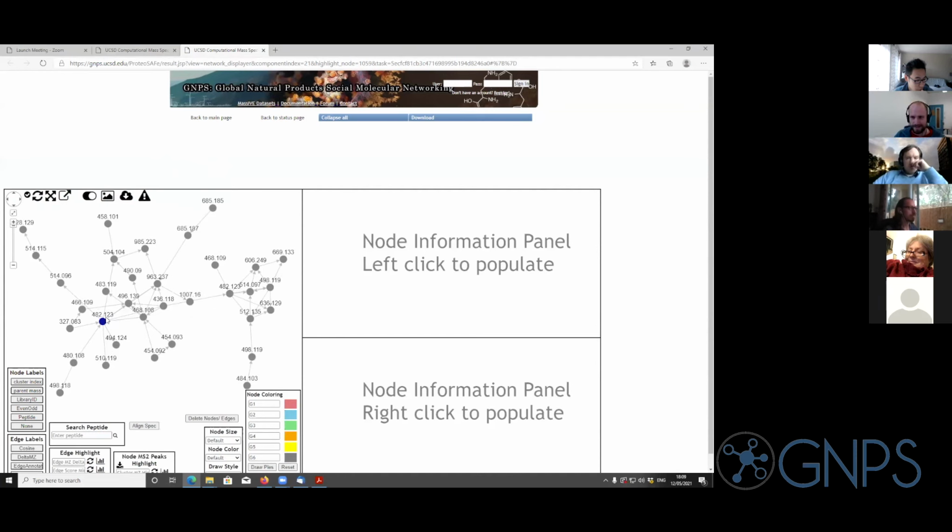I assume many of you have used this, but actually inspecting the raw data traditionally has been a little bit difficult. Here we typically had to open these files in an orthogonal software, most likely some vendor-specific software you had installed on your computer. And that entailed a lot of clicks and also quite a bit of expert knowledge.